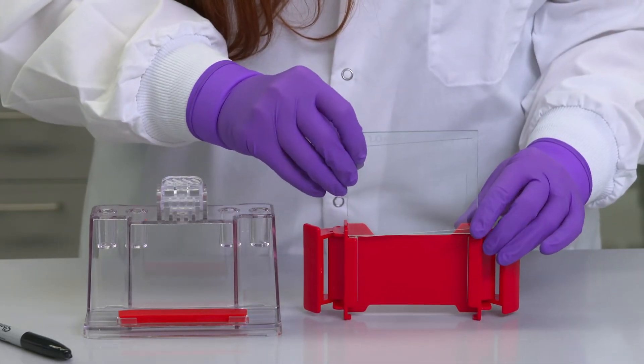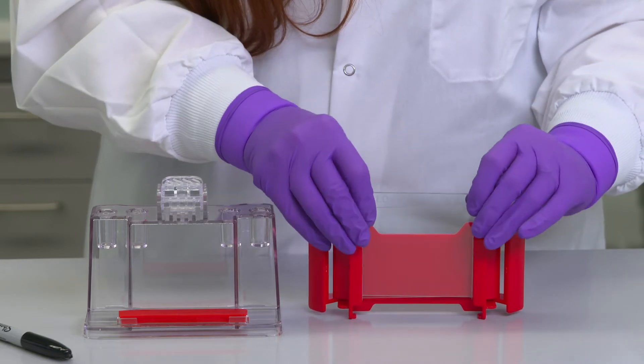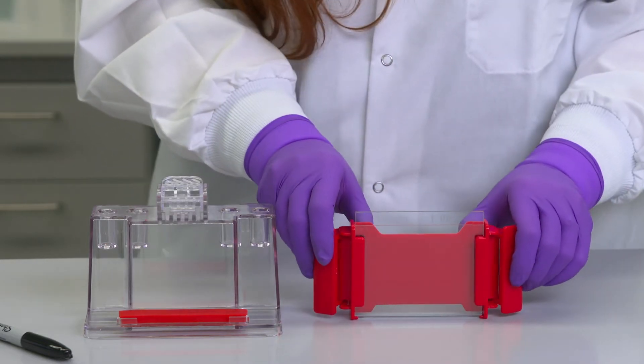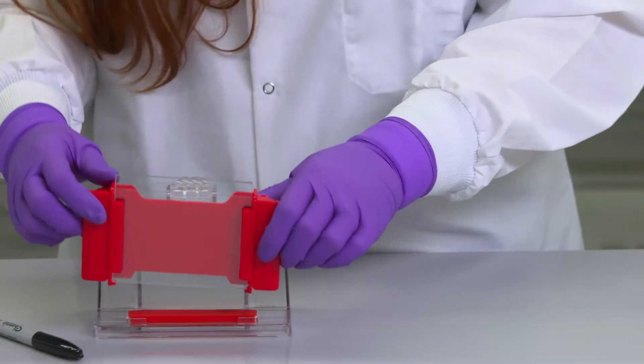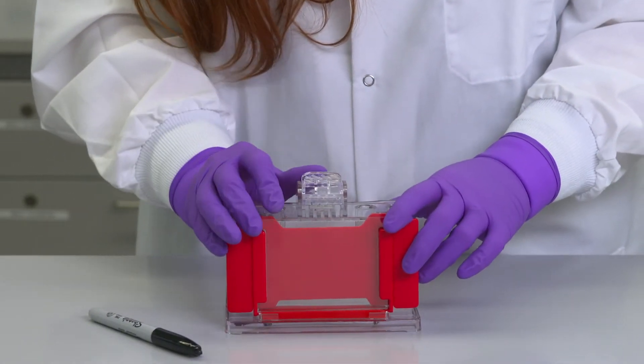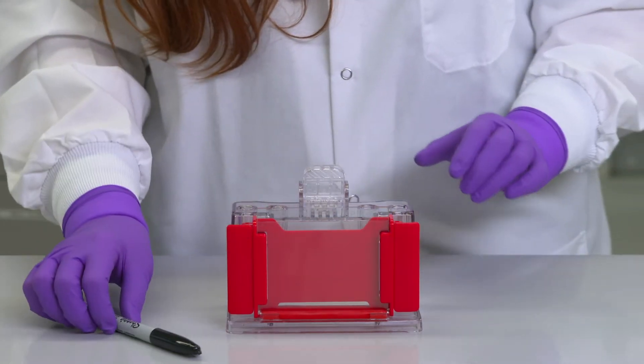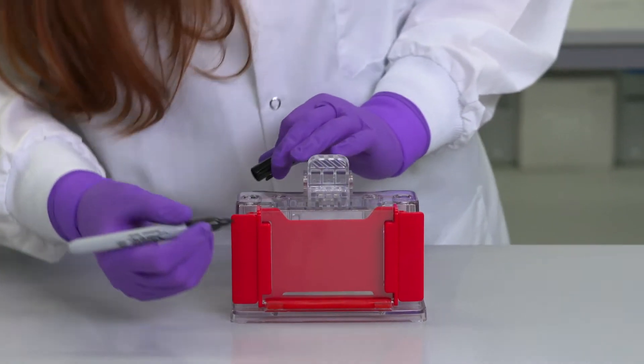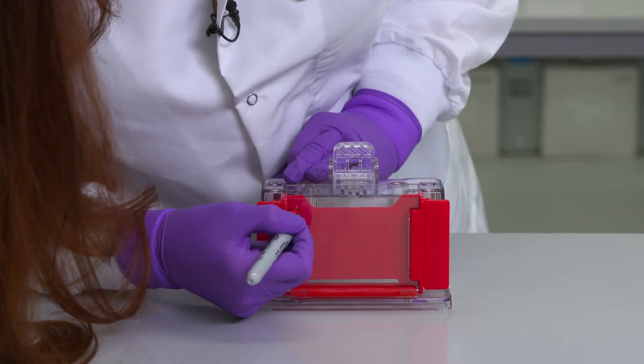Here I'll be using a mini gel cassette with a one millimeter thickness. The glass plates should be cleaned with alcohol and a lint-free wipe prior to use. The desired height of the resolving gel can be marked on the glass plates, usually one centimeter below the comb teeth.